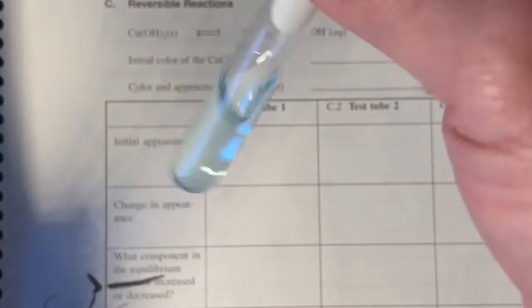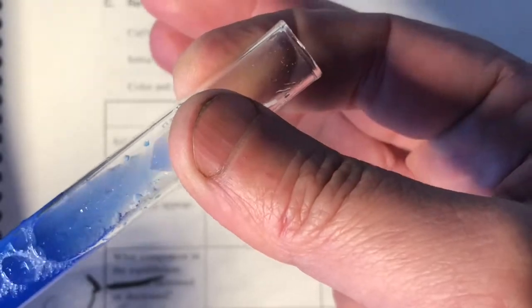And we added acid. There's the faint blue of some of the copper ions, but the solution is definitely very clear. I'm going to add a little more ammonia to this middle one and see if we can get that to really lose the opacity. Yeah. Oh, medium. All right.